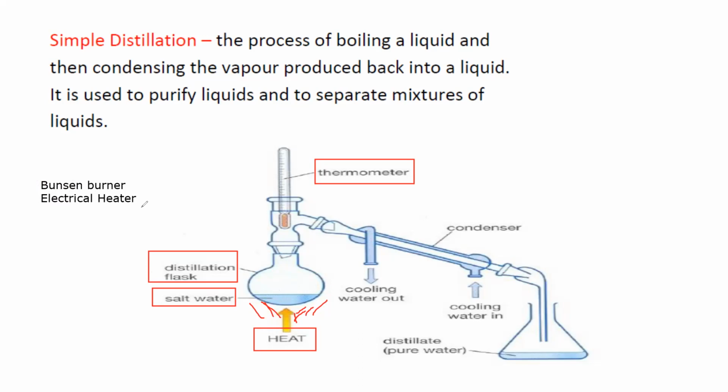a Bunsen burner or an electrical heater? If a liquid can catch fire, or if it's a flammable liquid, then which one is a suitable heating apparatus, a Bunsen burner or an electrical heater? Yes. So in that case, an electrical heater is suitable.